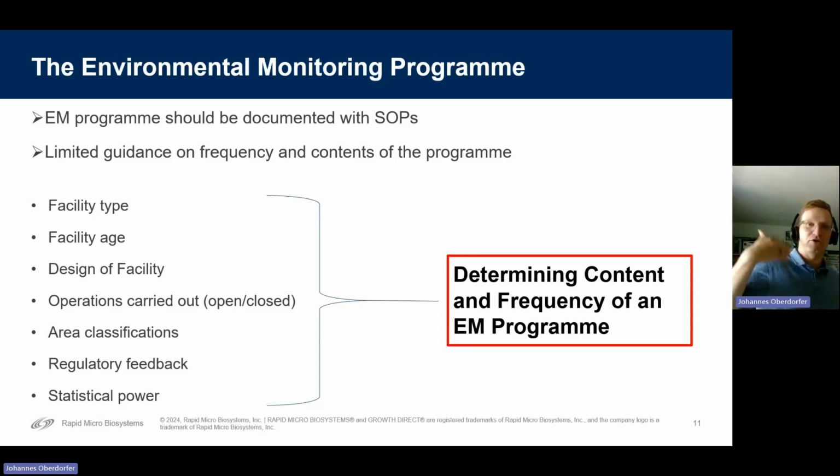And then again, it's periodically reviewed. And if we don't have enough data to decide what we should do, the periodical review should be very tight and at a short frequency. As we advance, it might get longer, but then facility age comes into play, or maybe different products, also equipment that we are using, monitoring equipment that we are using. Maybe there's the possibility to adapt, and this is what these programs and the contamination control strategy live from, that we adapt and review, and not only look at a set stage that we never change.